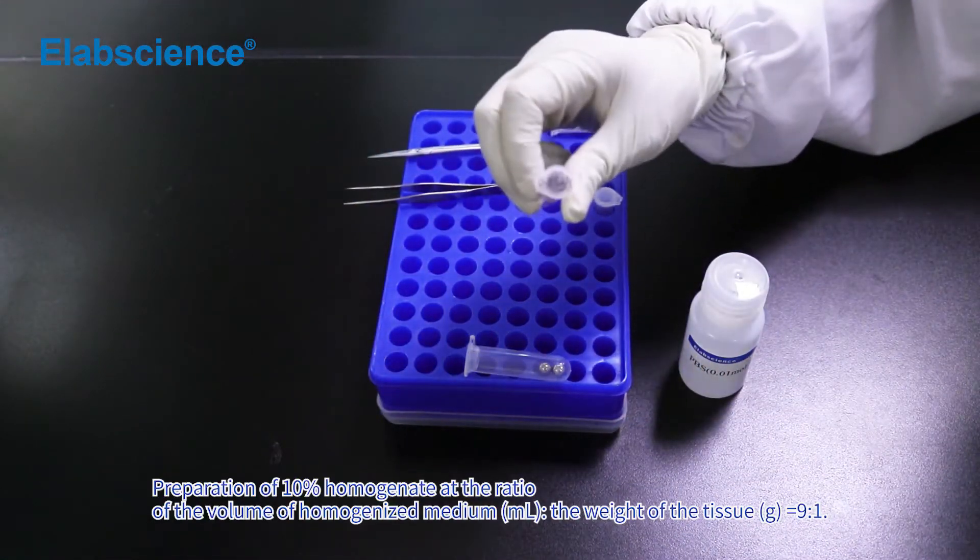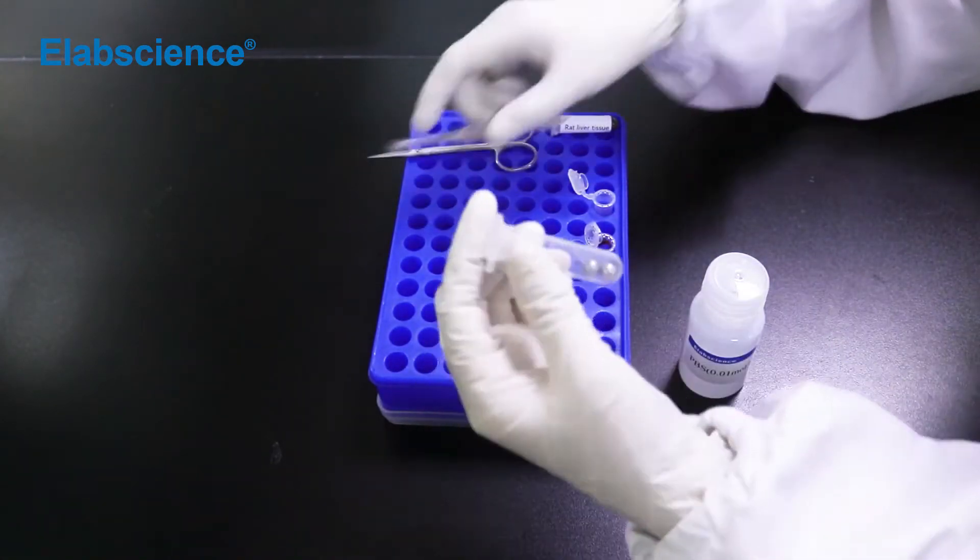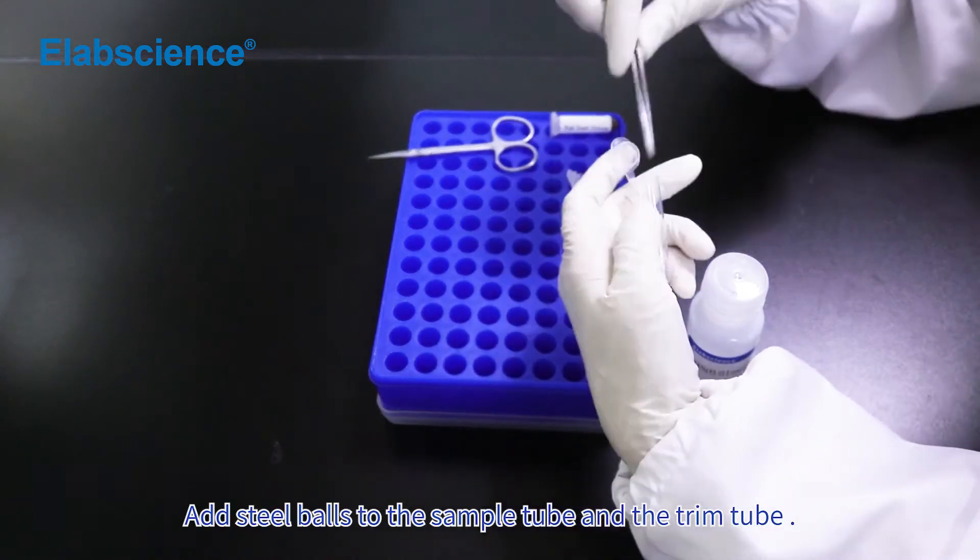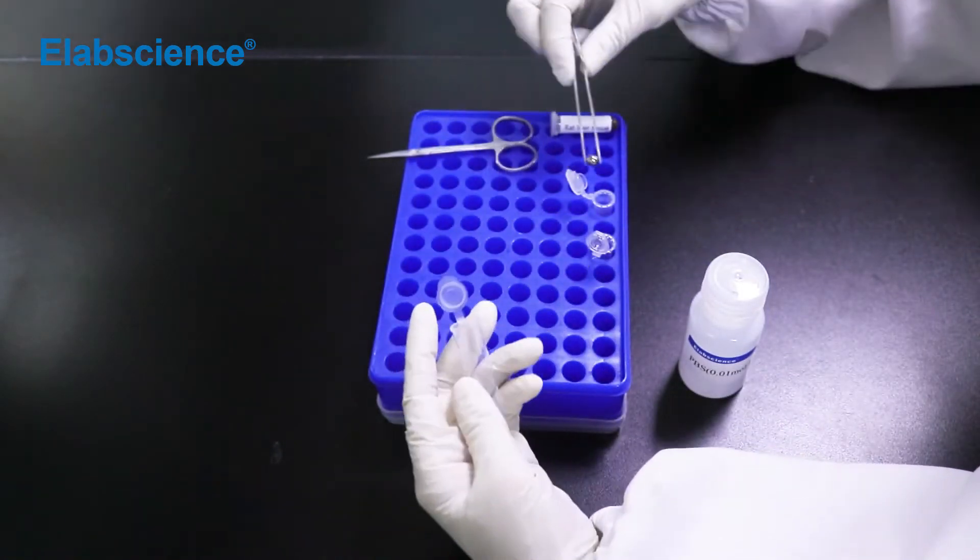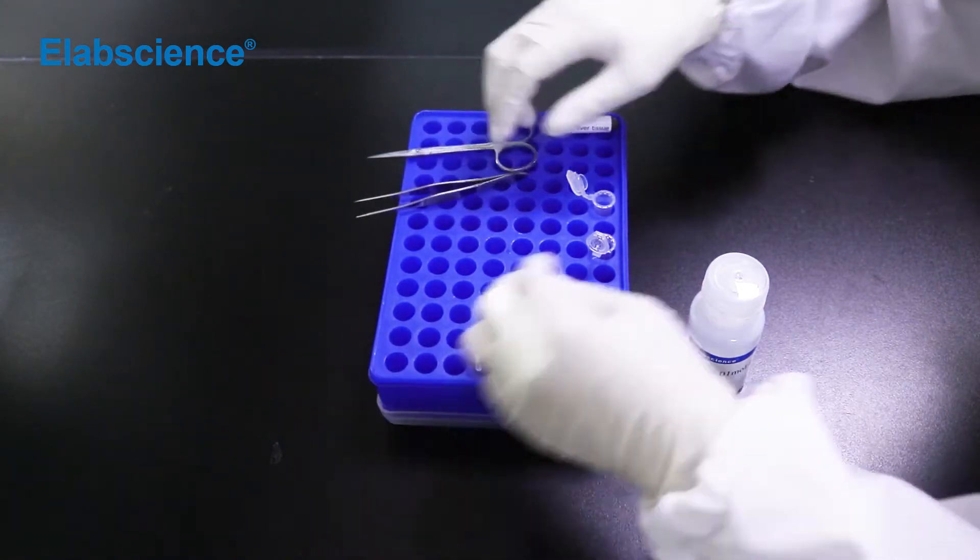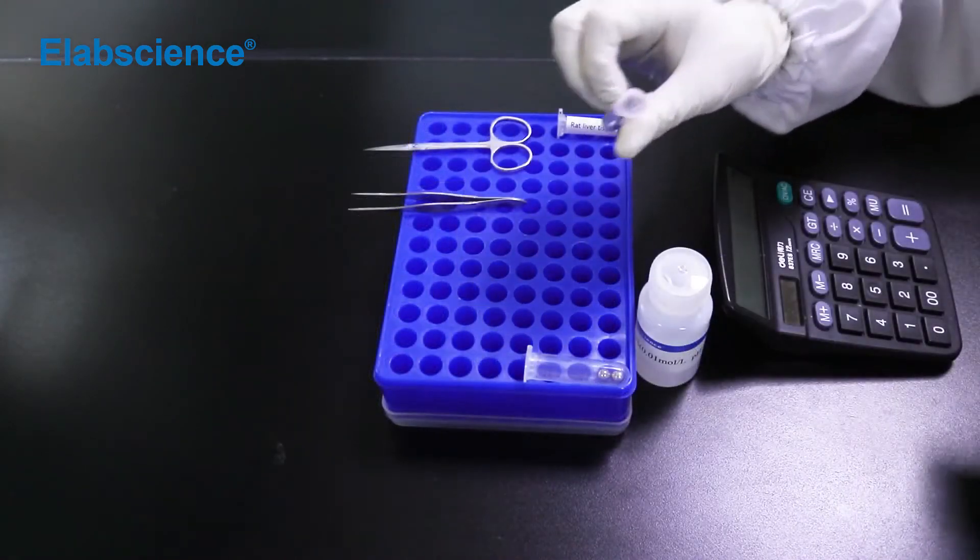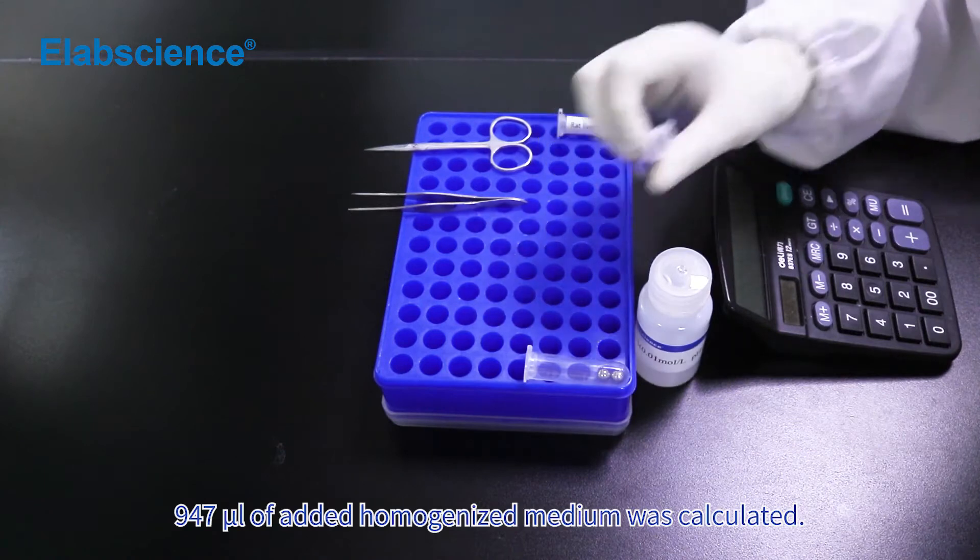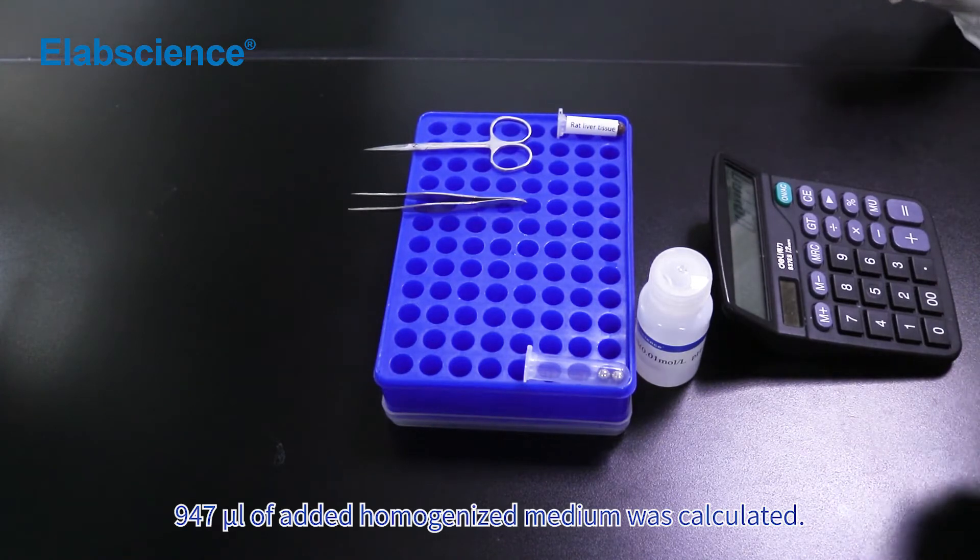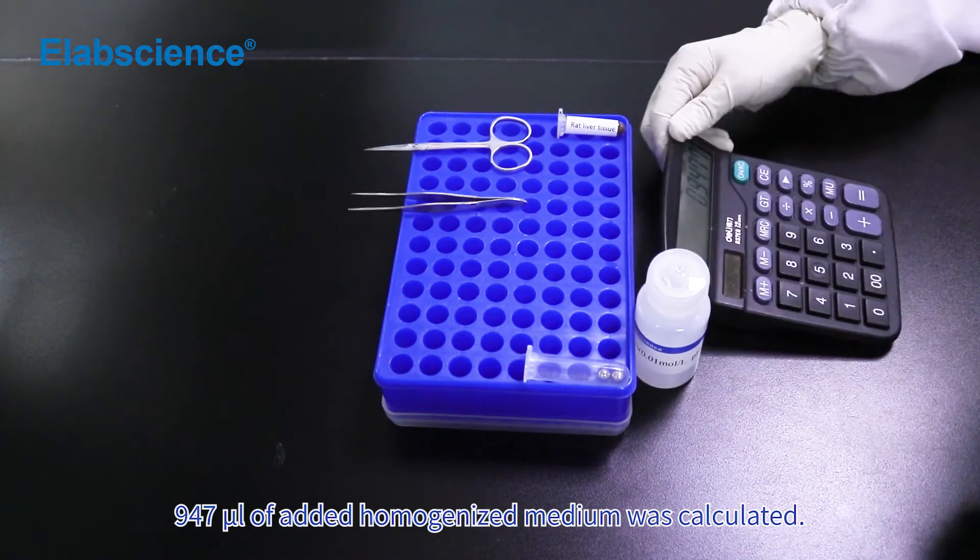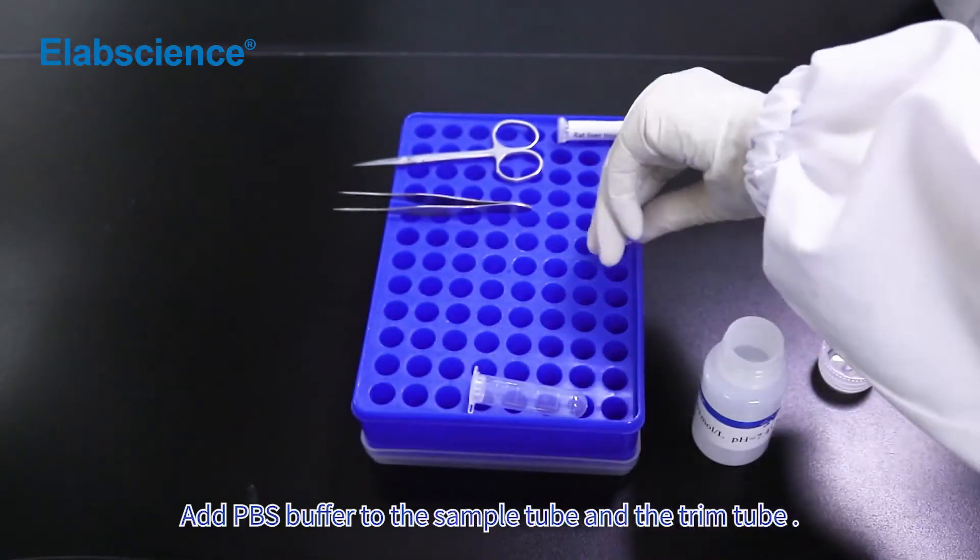Preparation of 10% homogenate. Add steel balls to the sample tube and the trim tube. 947 microliters of homogenized medium was calculated. Add PBS buffer to the sample tube and the trim tube.